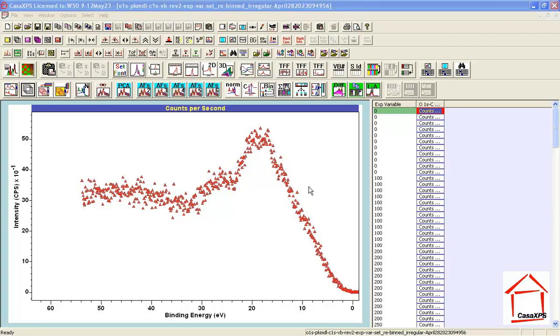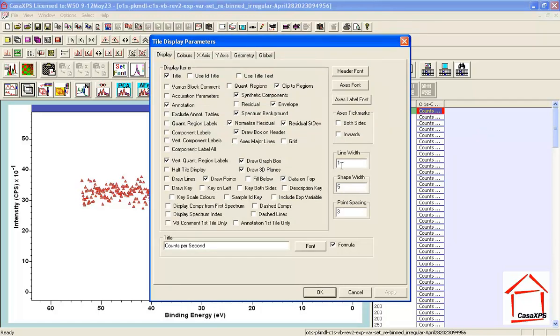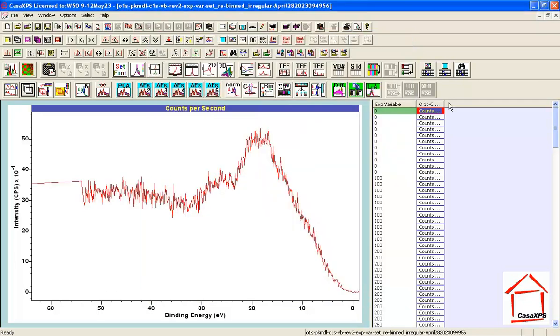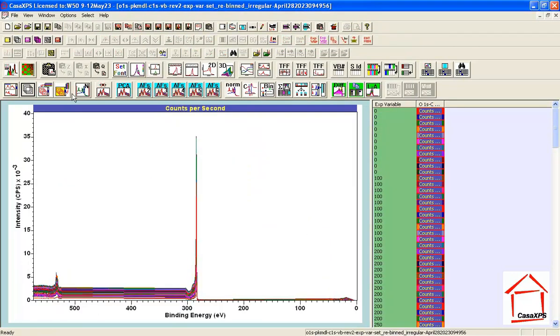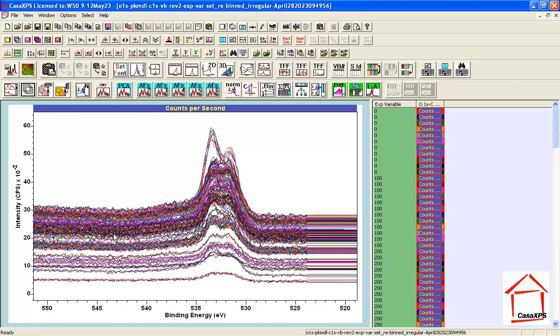The processing operations involving linear algebra require overlaid data. With a lot of data to display, I'll turn off points and return to drawing lines with a line width of 1 for graphical efficiency. I can overlay all the spectra with a quick refresh rate. Displaying the oxygen peaks, you can see they are reasonably noisy. The plan is to subtract one spectrum from another in different proportions to see how different proportions influence the shapes — understanding relationships between carbon, oxygen, and the valence band.